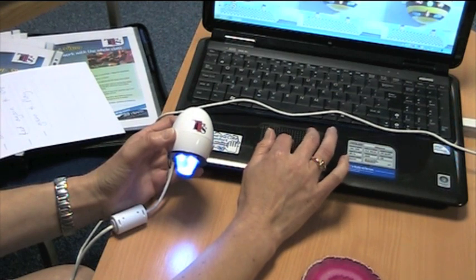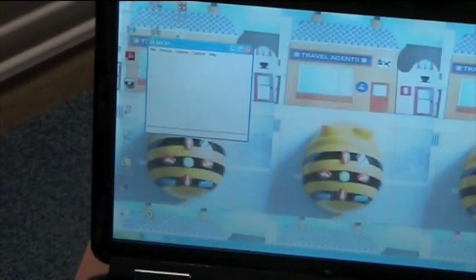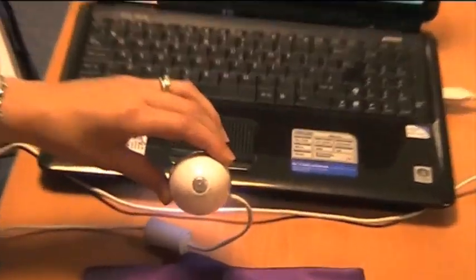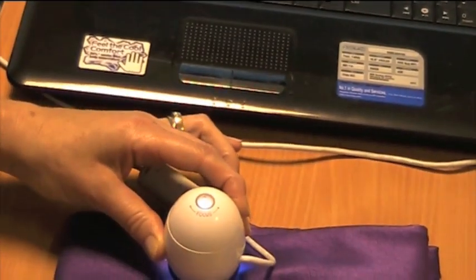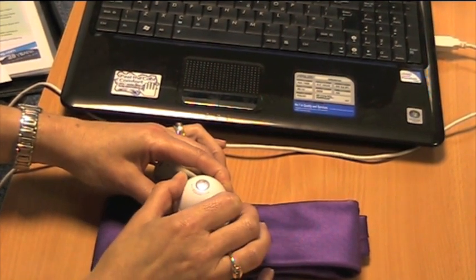I've already got the software installed on the laptop. If we double click on the icon, it brings the software up. It can be made full screen size. This shows the Easy Scope on a colleague's tie. It's very simple to focus — you can see we've got the focus here. When it's on your item, twist to the left or the right to fully focus.